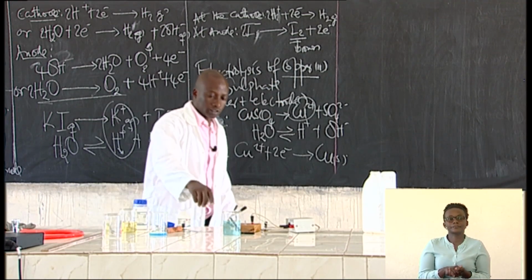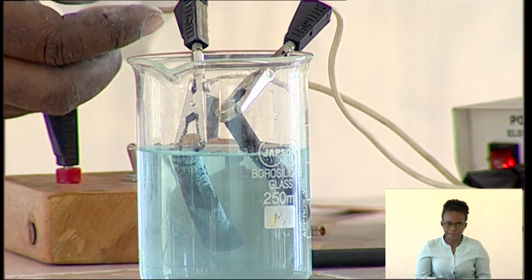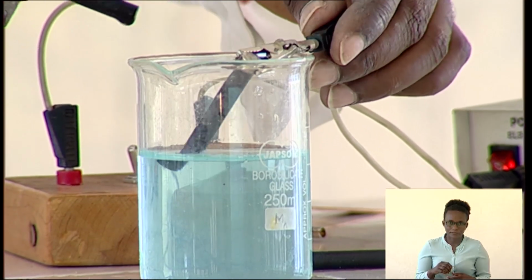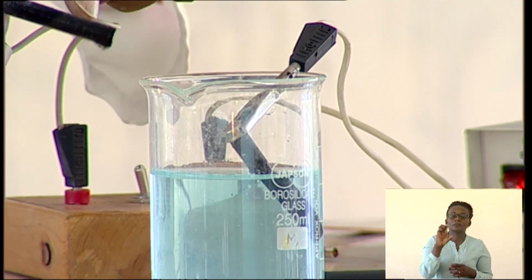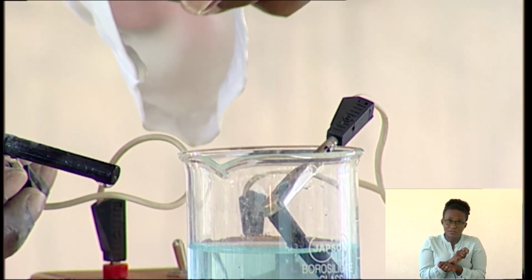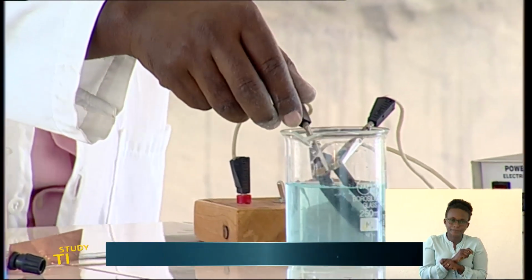and then changing into copper. So we expect, you see some spots. If we leave it there for some time, it is changing to this color, but very little is coming. It is just a matter of time.